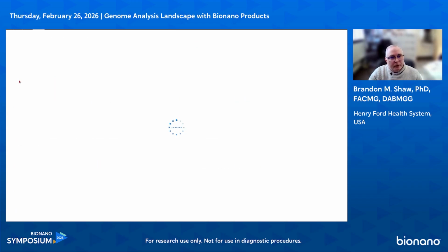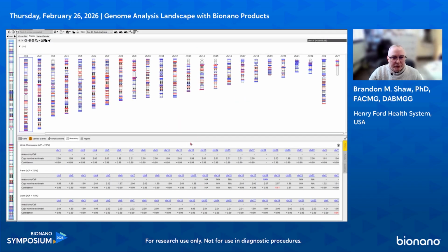So, all right, then you just simply click on that. It'll open up the case here. You can see that I have 2 windows that are split out. This first view is the post-analytical view. So the whole point of this view really is to try to determine if there are any large copy number changes. And the best way to do that is you can go through and look for these red and blue bars. This sample is pretty quiet as far as copy number changes.